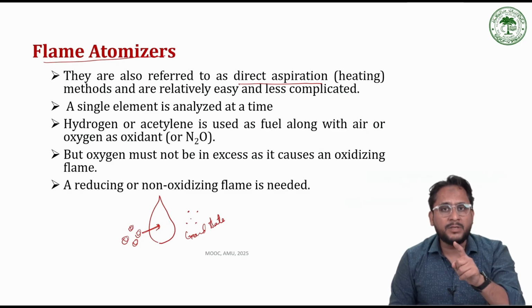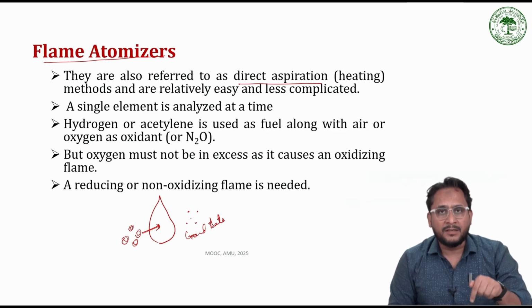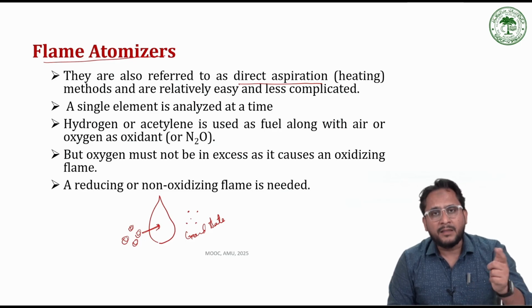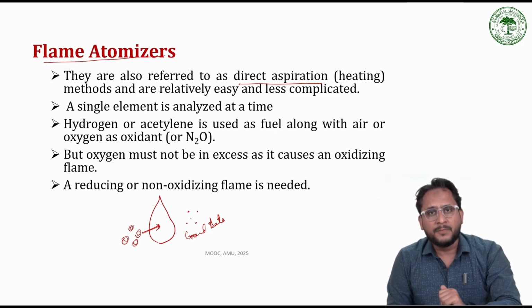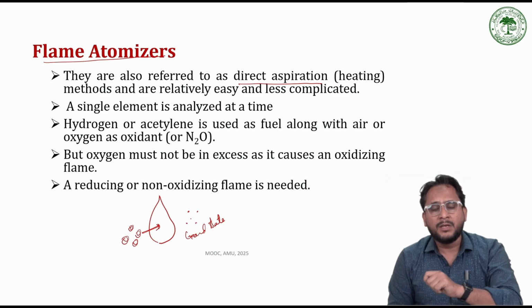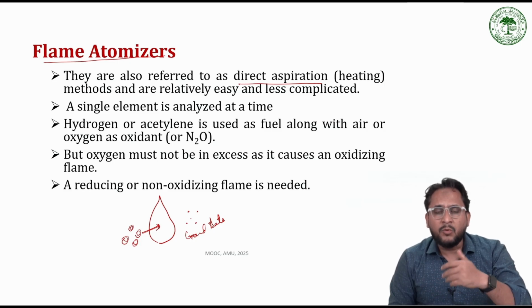If we excite those atoms with the help of this heat, they will start emitting light, and then it will be an emission spectrum. When we study atomic emission spectrum, there I'll explain that the atomizers used in atomic emission spectroscopy are even more intense.